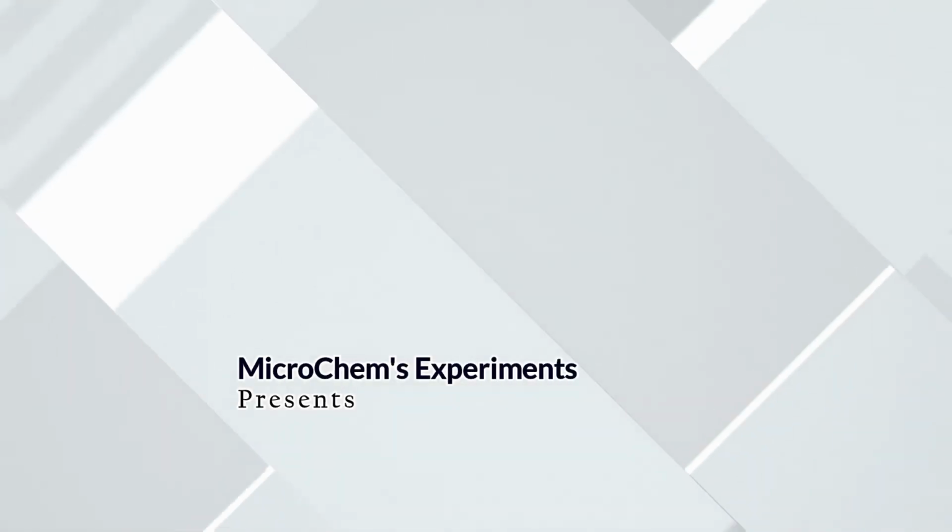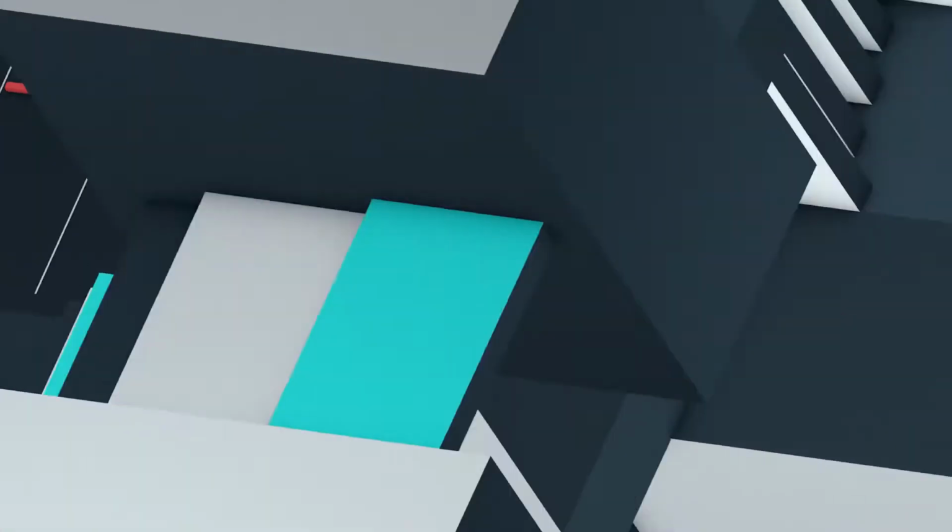We are Microchems Experiments, going to present you a complete procedure for determination of sodium in table salt.